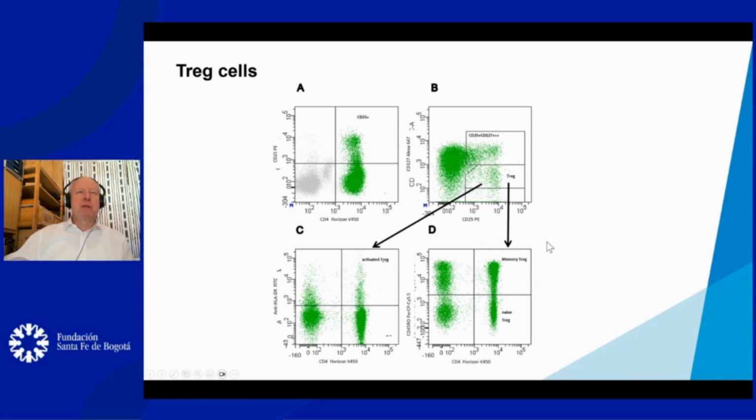The main problem in this approach is with the surrogate markers CD25 and CD127, we can miss Tregs in Treg deficient children with the IPEX syndrome. So for these children, we have to apply intracellular staining.